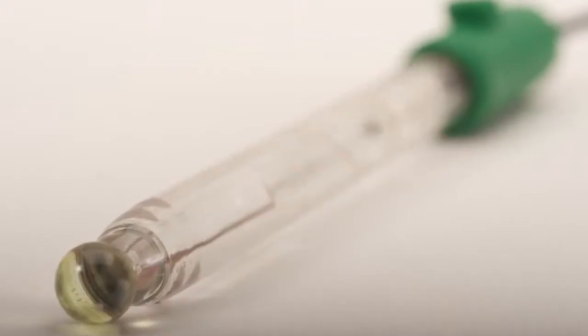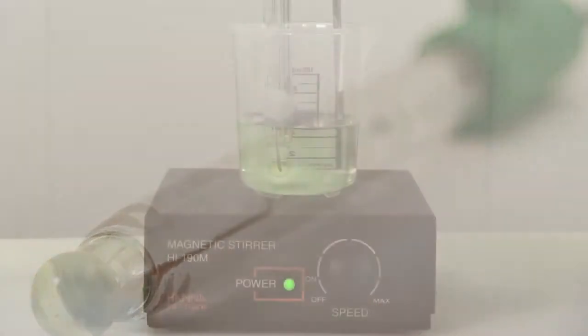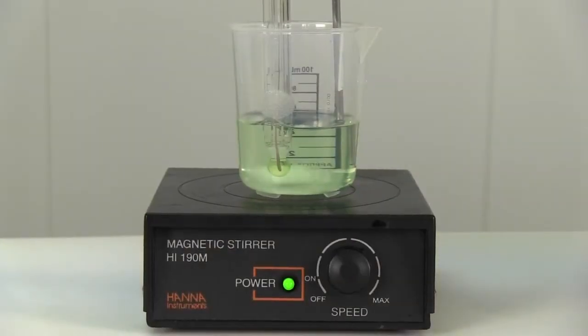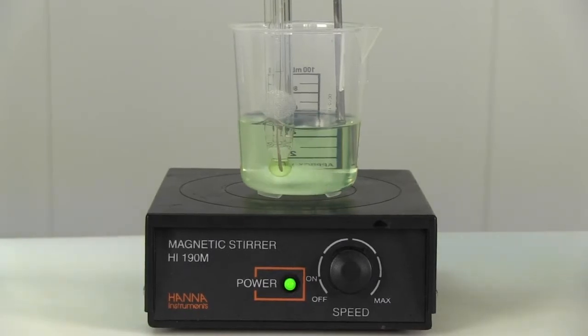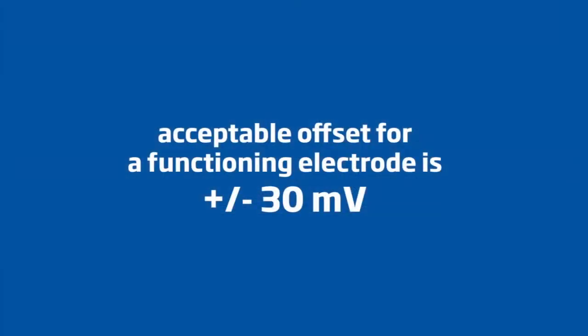Let's begin by determining the offset of our electrode, in this case the HI1131B. To determine the offset, check the millivolt reading of the pH electrode in a pH 7 buffer. An acceptable offset for a functioning electrode is plus or minus 30 millivolt.